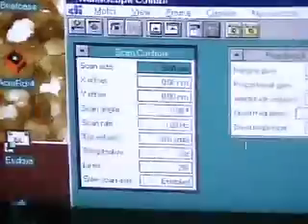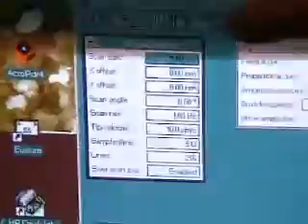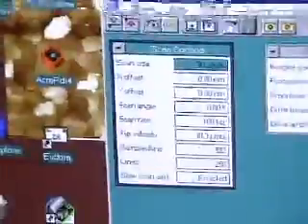Let's go ahead and just go down what each of these different items means. Scan size, that's the lateral scan size. X and Y offset, usually you don't control those directly from this menu, but rather if I'm taking a large image, let's say I'm taking a 5 micron image and I want to zoom in on one part of it, I can go over on this right box and click on zoom in, and it gives me a little white box that tells me where I'm going to zoom in.